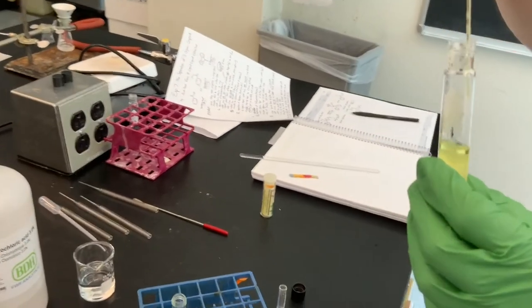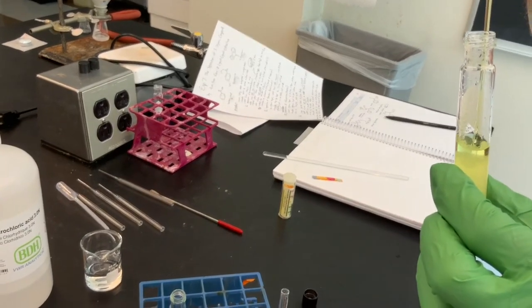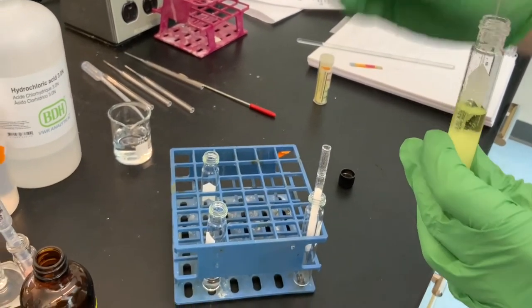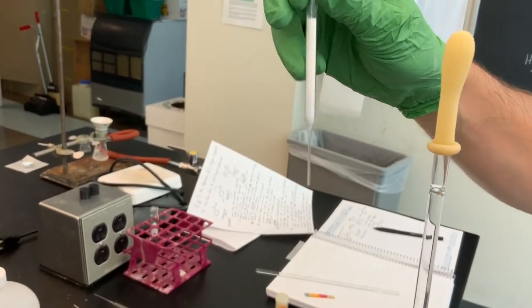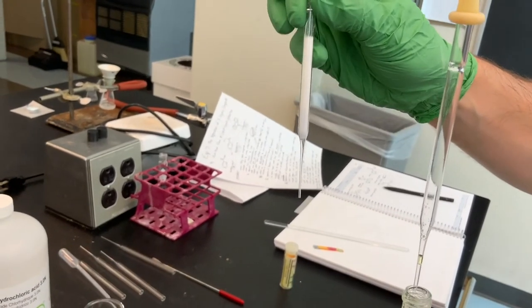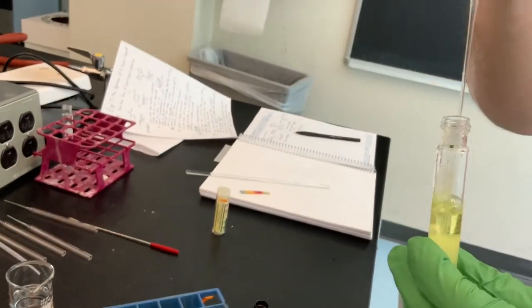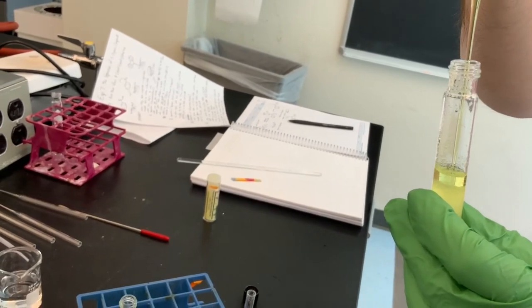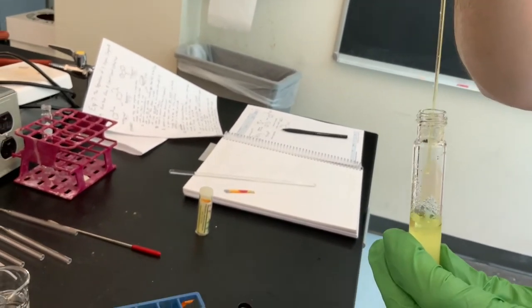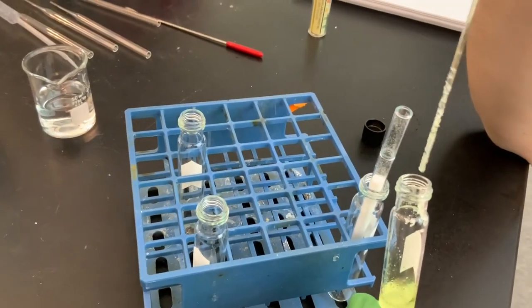All right, so now that we've dried our organic layer, all we have to do next is draw it up, filter it through the 5 3/4 inch Pasteur pipette where we've added sodium sulfate to act as a filter. There's a piece of cotton there at the end. So this is the last line of defense. It'll further dry the methylene chloride if it's not really super dry. And it'll also filter any sodium sulfate that I might accidentally draw up in the pipette, because you can see there are already some crystals up there and on the sides of the tip as well.